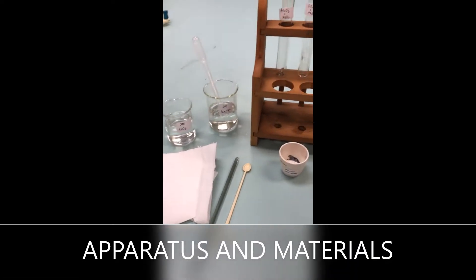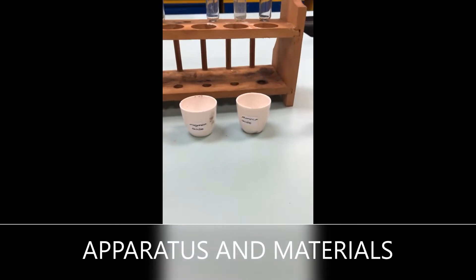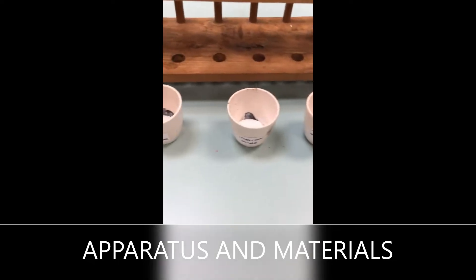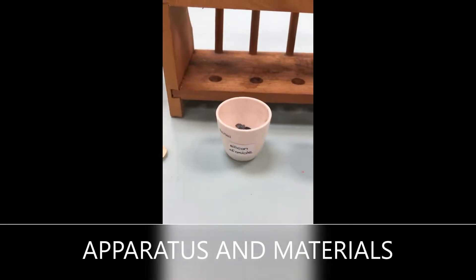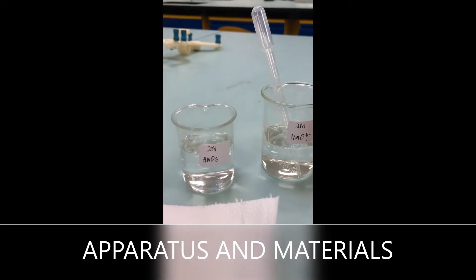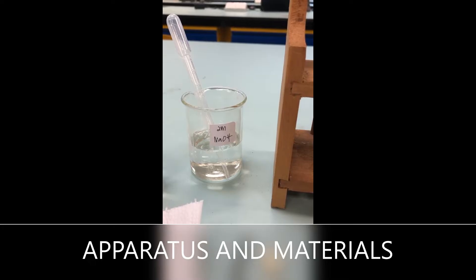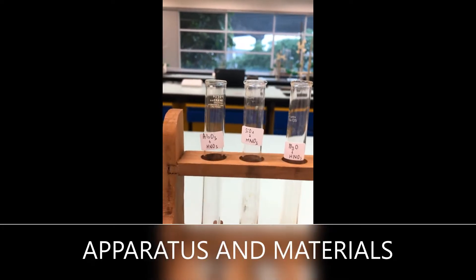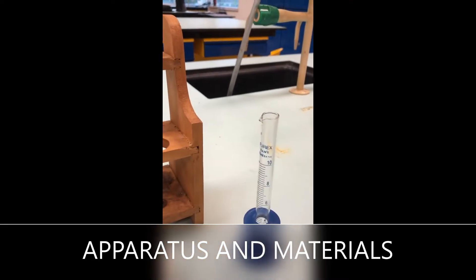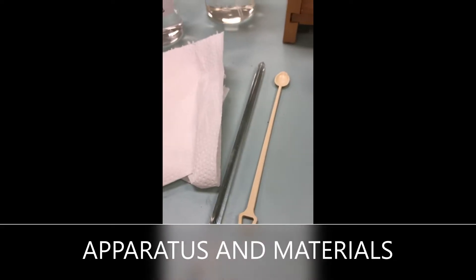Alright guys, you can have a look at the period oxides and material setup. Over here I have got aluminum oxide powder, magnesium oxide powder, and silicon dioxide. On this side we have got nitric acid 2M, sodium hydroxide 2M, labelled test tubes, a measuring cylinder, a tiny spatula, and the glass rod.